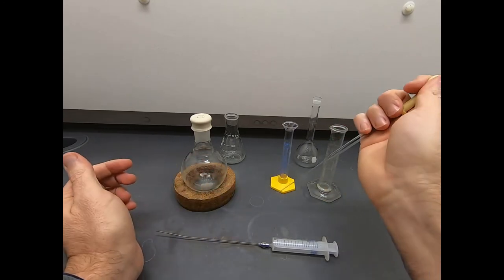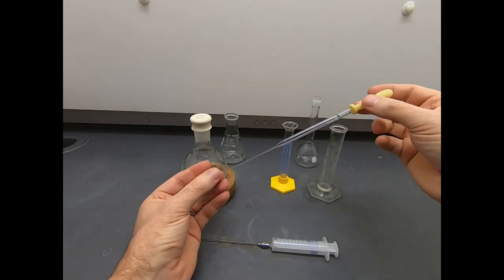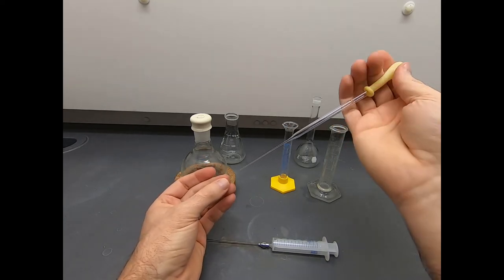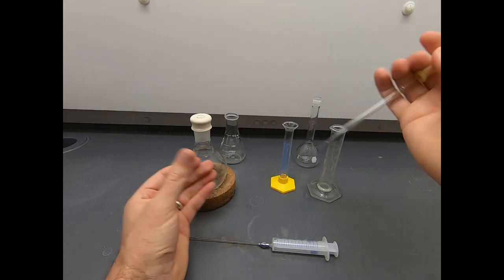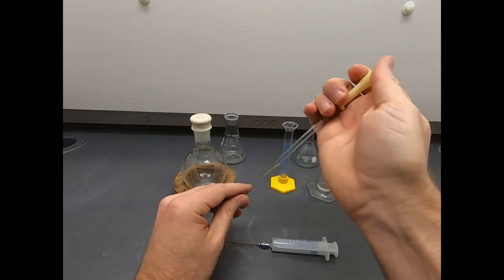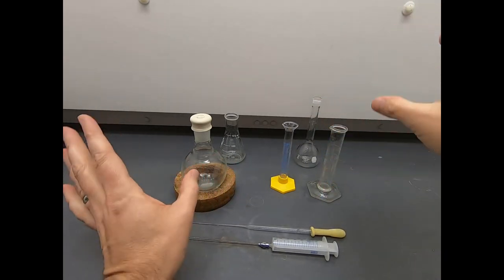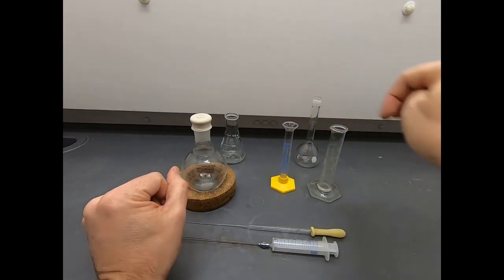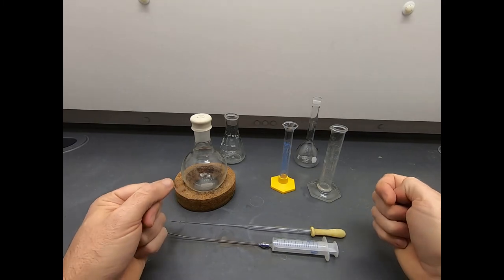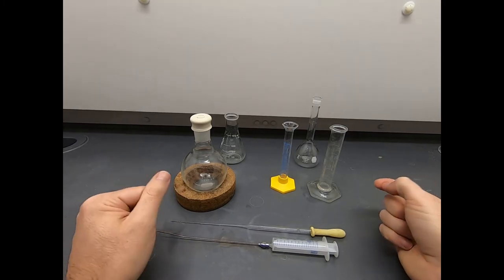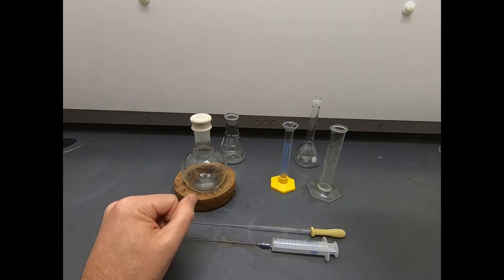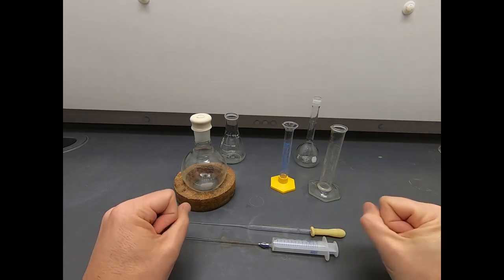Now sometimes I've actually used pipettes. Pipettes are very imprecise, but these longer pipettes, they have about a two milliliter capacity if you fully squeeze down the bulb and let it in. I'll use things like a glass pipette as a rough estimate. But if you want to know with really any accuracy, you'll need to use a graduated cylinder for transferring liquids. For solids, we use a balance to get the mass. For liquids, we use graduated cylinders typically to get the volume.